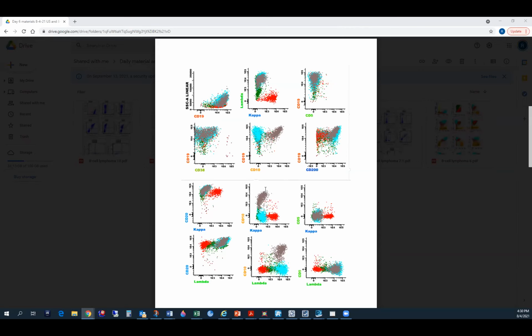So they will say all CD19 positive cells, this much. And then under the CD19 positive cells, they will give 10 positive, this much, like that. So you will see the color coding will be there. This color is this much, this color is this much. It's like that.